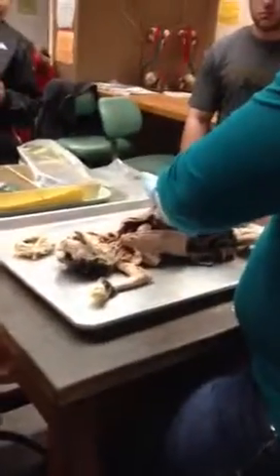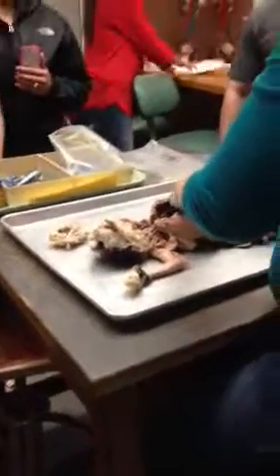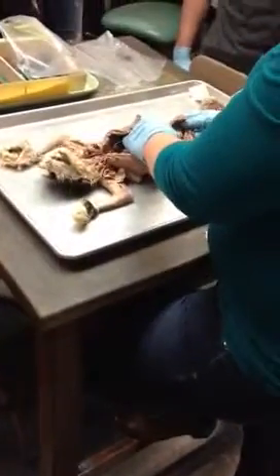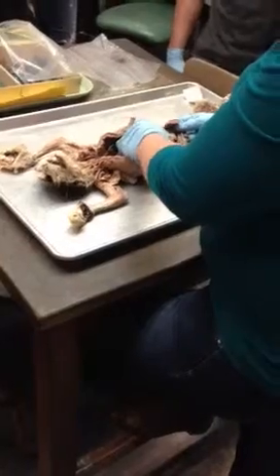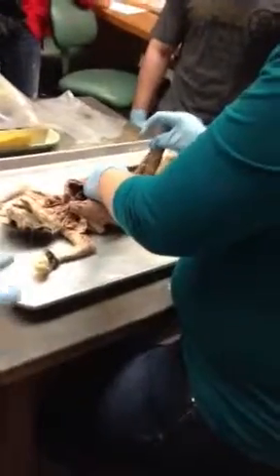What's this? Spleen. Nope. Diaphragm. Diaphragm. Good. Okay. This is the spleen. This is not the pancreas, okay? The spleen has a nice defined border to it. You can see the, what was this called? Greater omentum. Good. Greater omentum was attached to it.